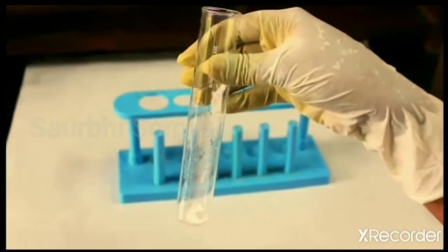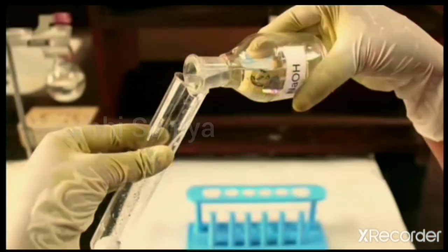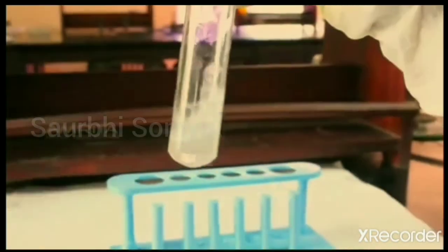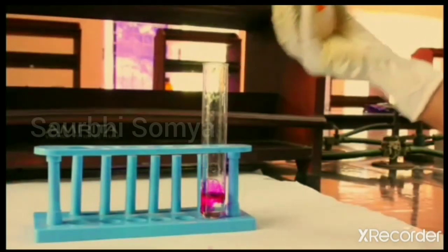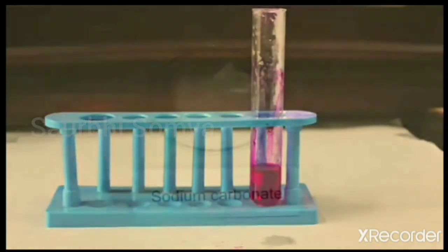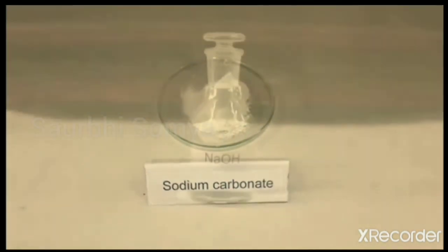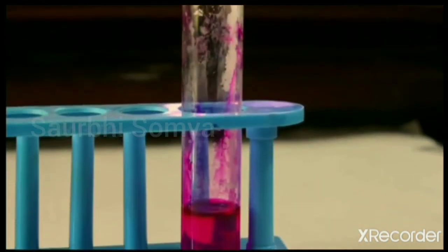Now add a small amount of sodium carbonate in a boiling test tube, add NaOH solution into it and shake the tube well. Add a few drops of phenolphthalein, and we can observe that the color of the solution turns pink, which indicates that sodium carbonate and NaOH do not react but form an alkaline solution.